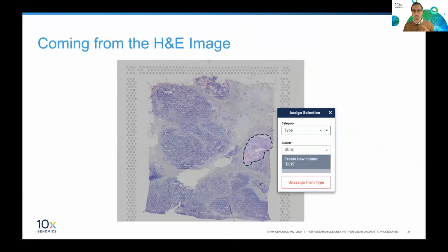So now what we can do is actually select an area in the tissue, and we can do as many selections as we want, because what we've done is we captured all the data during the experiment. So you don't have to select a region and then, oh no, I selected the wrong region, I wanted to make it a little bit larger, a little bit smaller. All that you can do in data analysis. So no regrets there. So now we select that region.